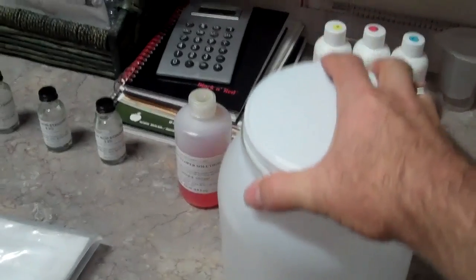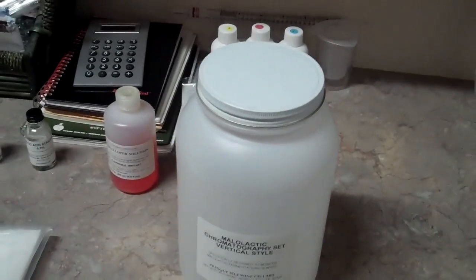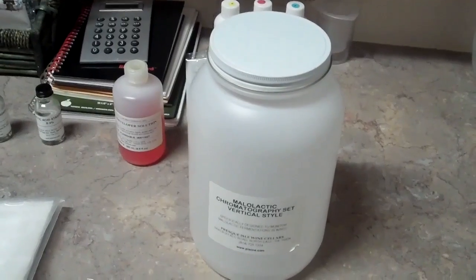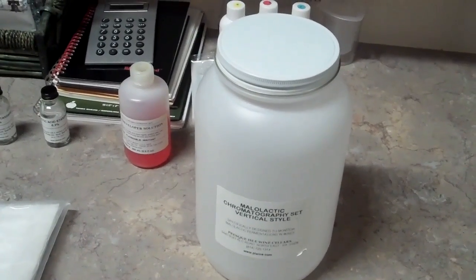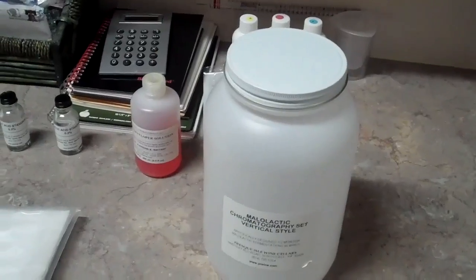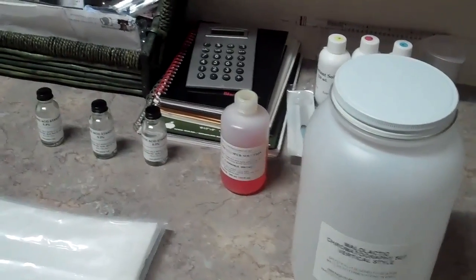This is the one-gallon container that we use to actually put the solvent and the paper in once we've put the different acid spots on the paper along with your wine samples.